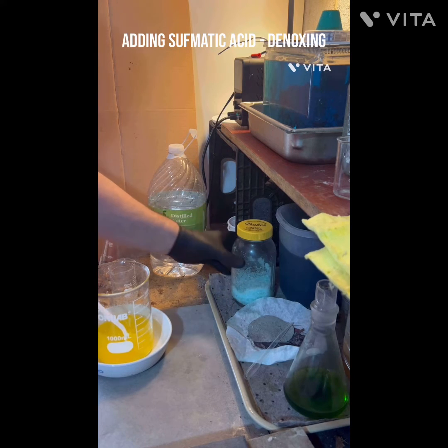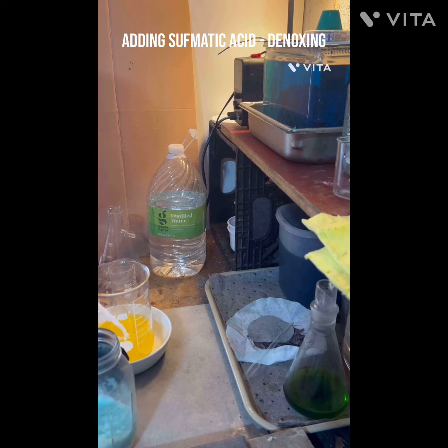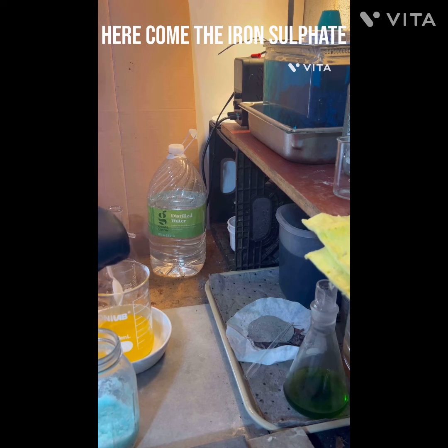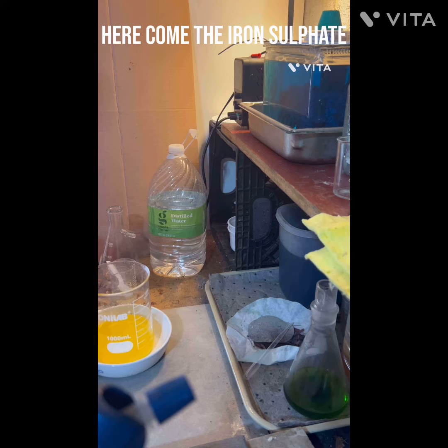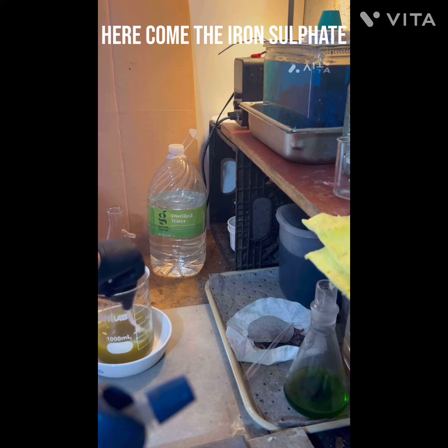Time for our favorite - ferrous sulfate. We're even going to use a new spoon. Brought to you by cha-ching - not really, but I thought I'd throw that out there for a little humor today. So here we are with the ferrous sulfate. I'm going to put this on heat, we'll come back to it. Look at that great gold - this is the second drop, by the way.